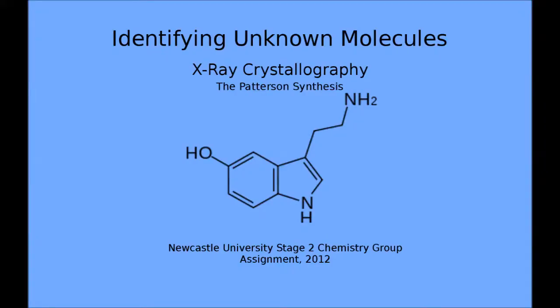By creating this Fourier transformation, every reflection is now important to the structure, as every reading is equated to the entire molecule. Single atom positions cannot be decoded, only the entire unit cell. It is, however, now that we encounter the phase problem when we go to decode the transformation. As we try to reverse the Fourier form, we once again come to see that the phases are unknown. This problem has taken 2 Nobel Prizes to solve.